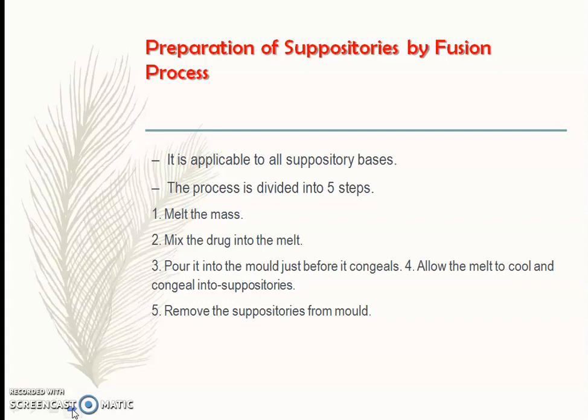First, you have to melt the mass, then mix the drug into the melted mass. The third is to pour it into the mold just before it congeals. Fourth, allow the melt to cool and congeal into suppositories. Then remove the suppository from the mold.